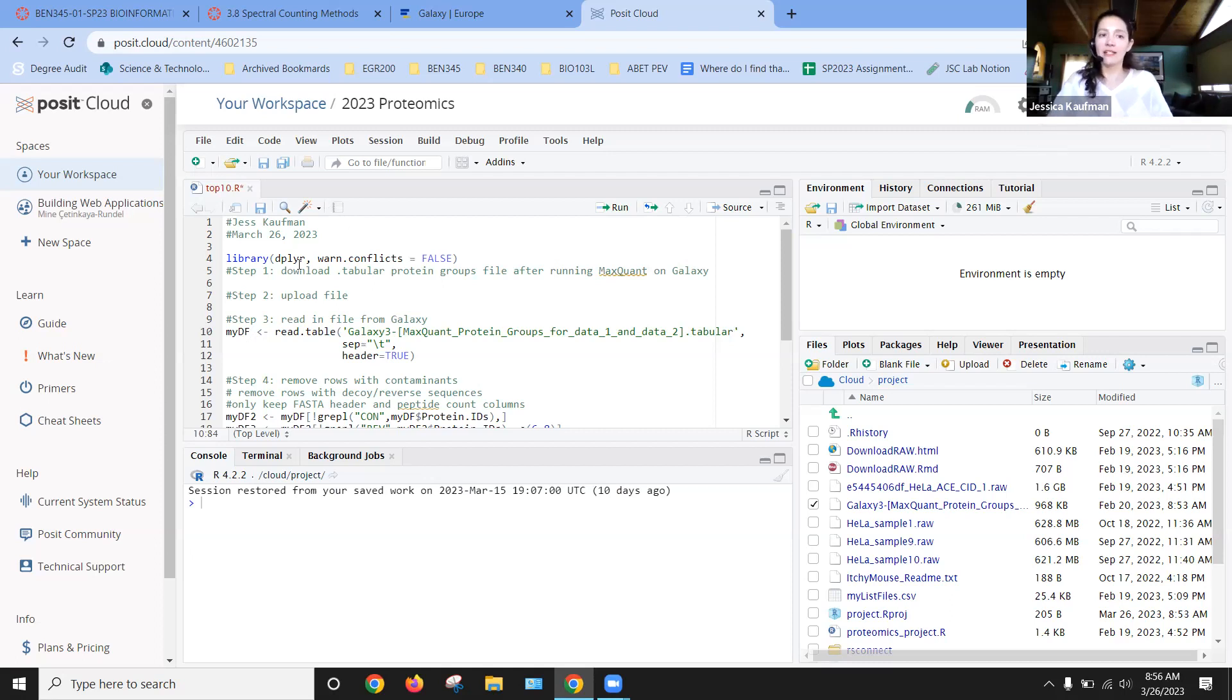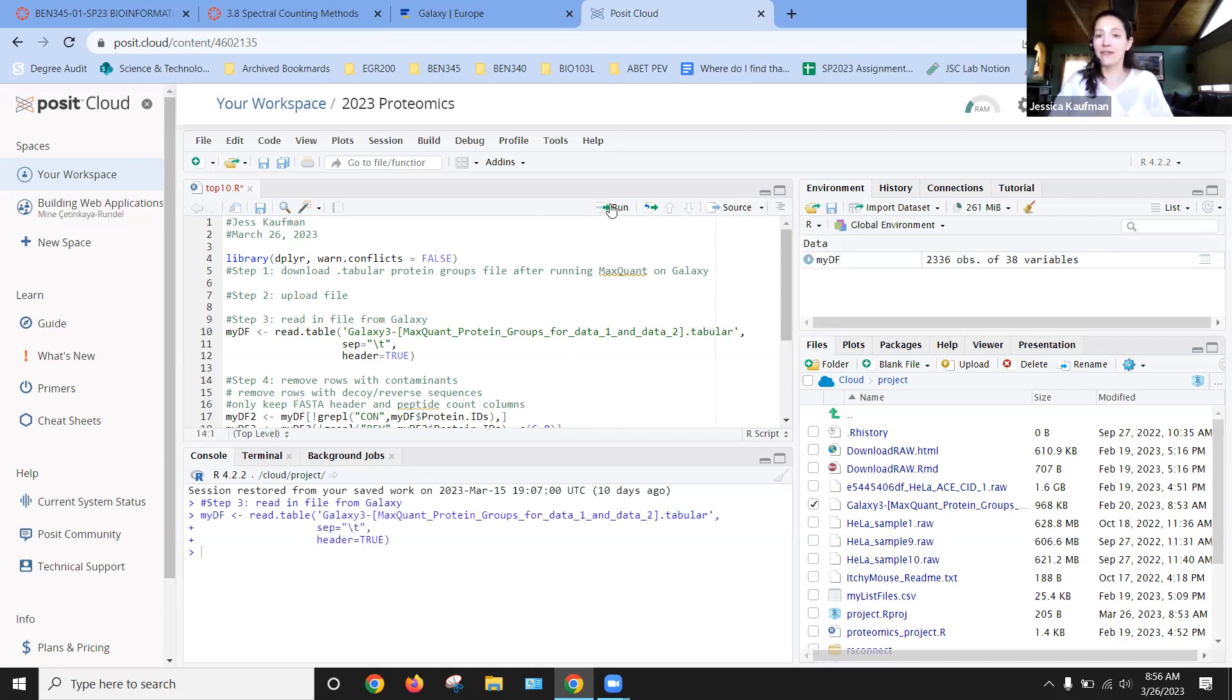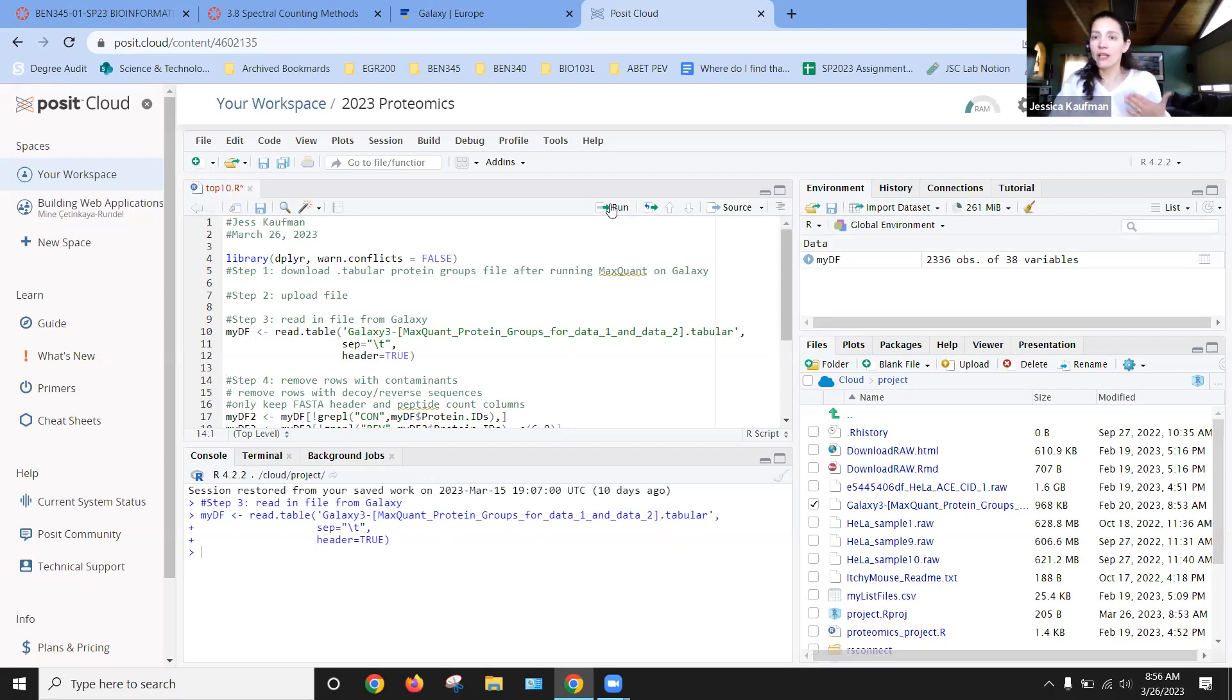So I've already done steps one, two, and three. I've downloaded the file, uploaded the file, and now I'm ready to run this line to read in the file. One of the first things I want to check is the size. So if something went wrong as I read in the file, we end up with a different size file.